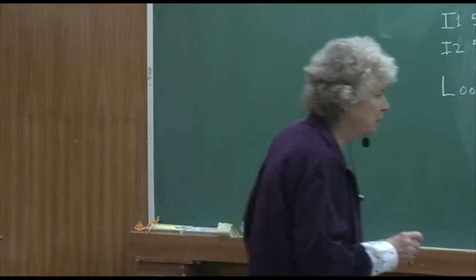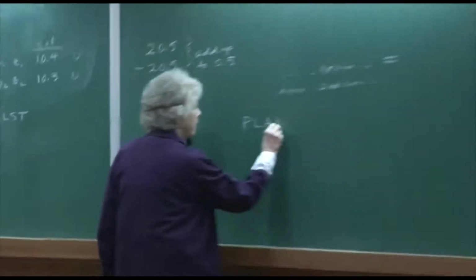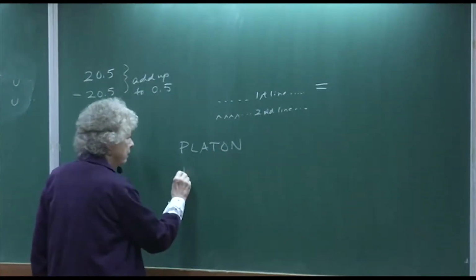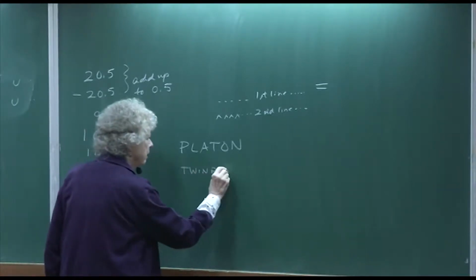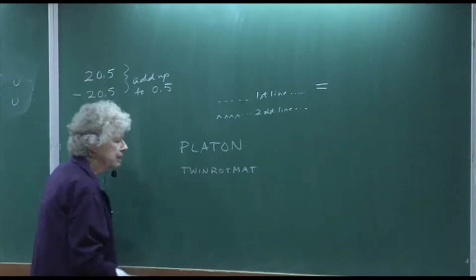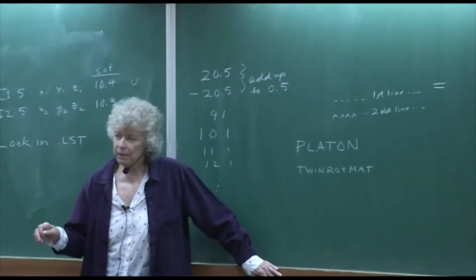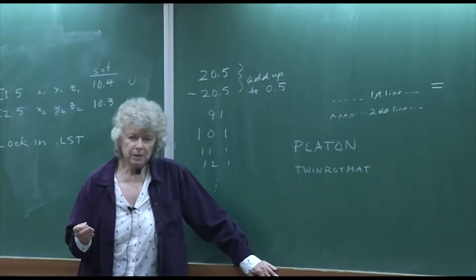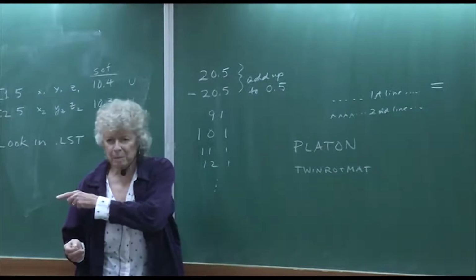Oh, I didn't mention this before either. Yesterday when we were looking at Platon, you put your CIF and your FCF file in, and you check on the twin rotation matrix box. One option was to output the HKLF5 file. Do you remember I did that yesterday? But there's another option, which is just to look at this matrix, which is just a set of 9 numbers.